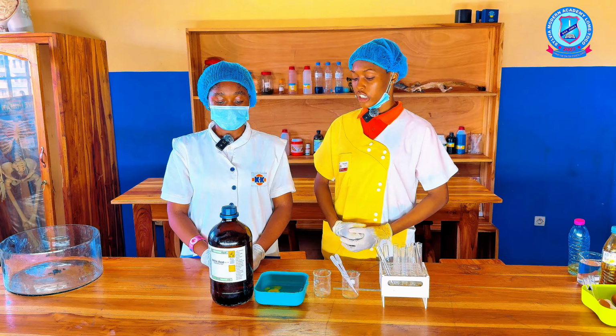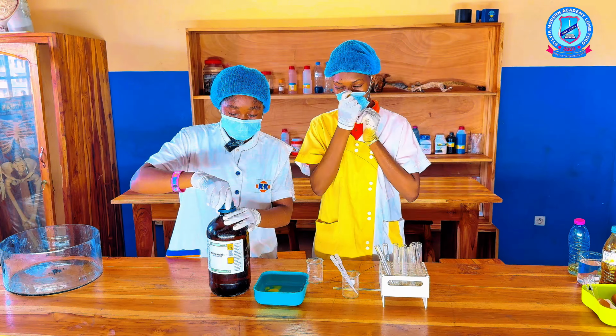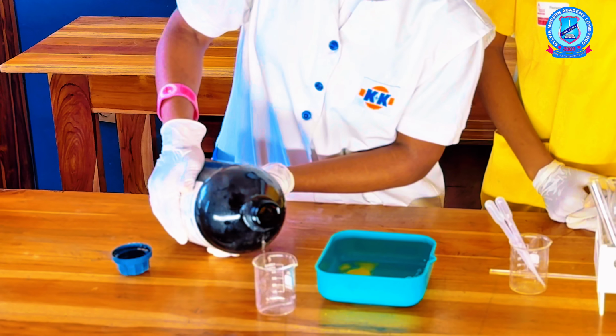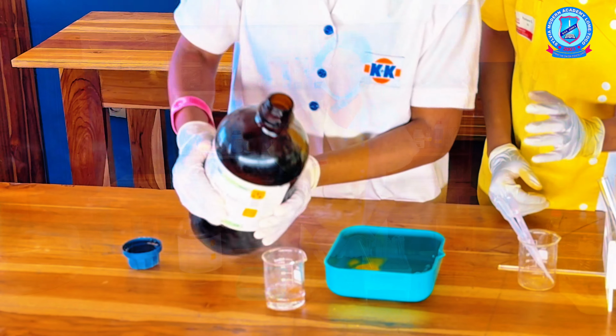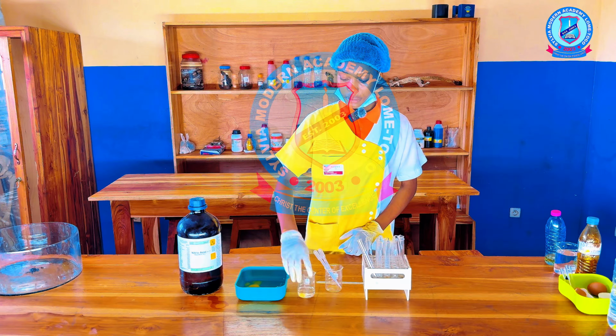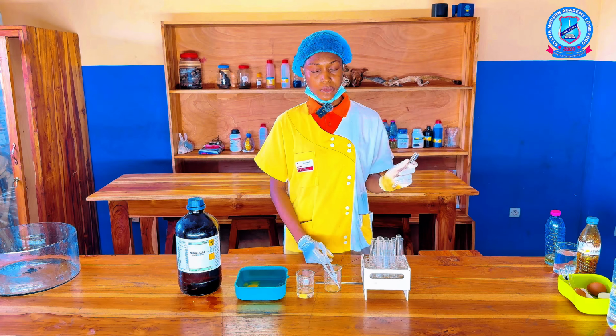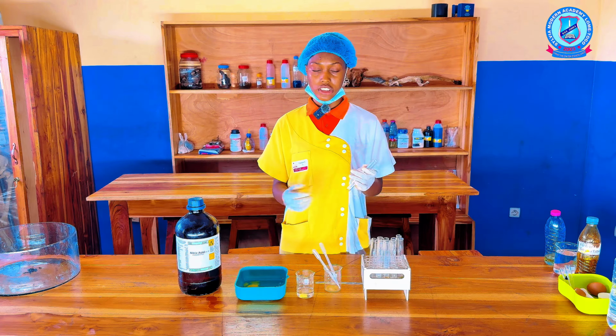We are going to pour our nitric acid into this beaker to use for the experiment. We are going to pour 10 milliliters of our nitric acid into the beaker. Here in our beaker, we have our 10 milliliters of nitric acid. So we are going to take our test tube and add a sample of our egg white into the test tube.